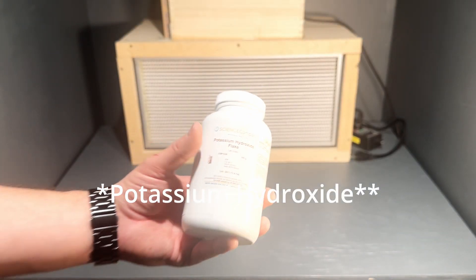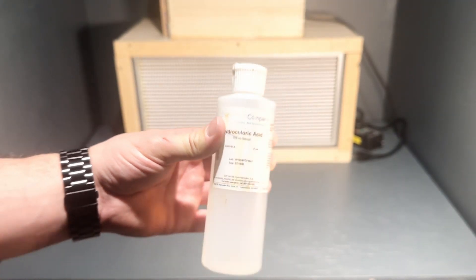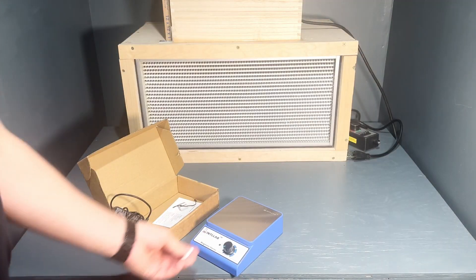Sodium hydroxide for pH up — you can also use baking soda for pH up. Hydrochloric acid for pH down — you can also use vinegar for pH down. Glass beakers; I just ordered some of these online and I think it's going to make everything a lot easier. And a magnetic stirrer.